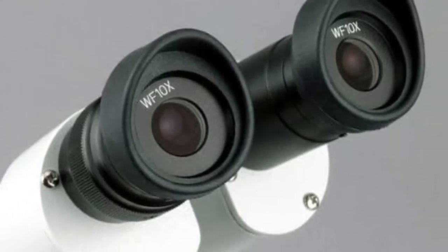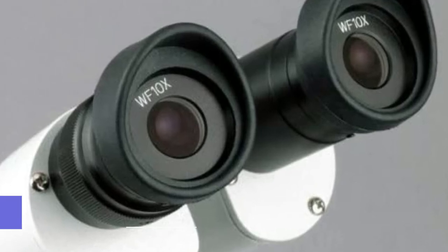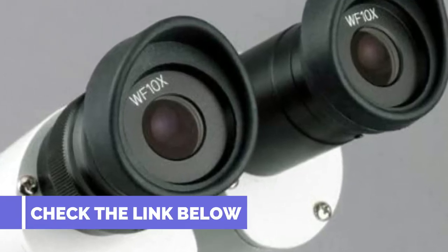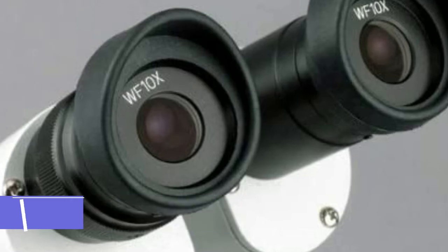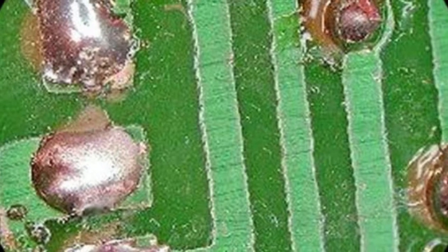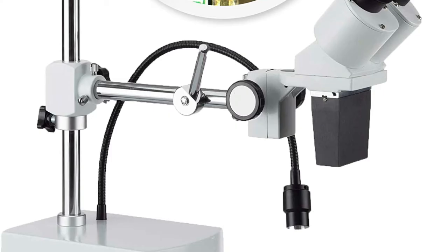Making it ideal for both younger users and adults. WF10X and WF20X eyepieces combined with the 2X and 4X objective will provide the user with 20X, 40X, and 80X magnification and a longer working distance.